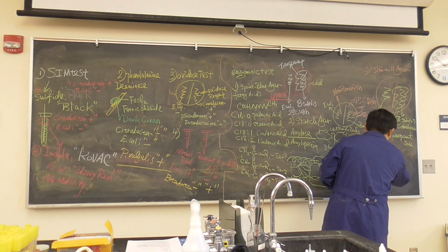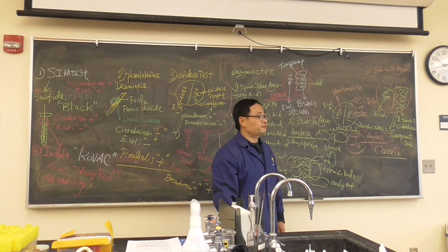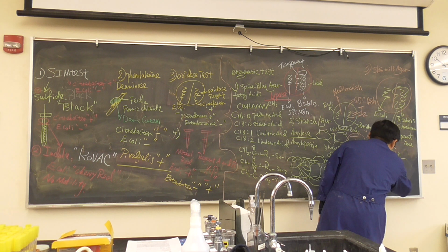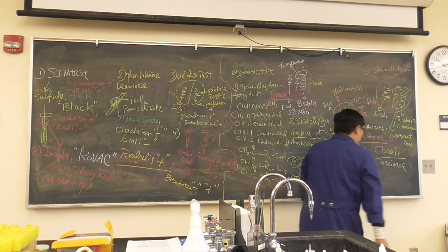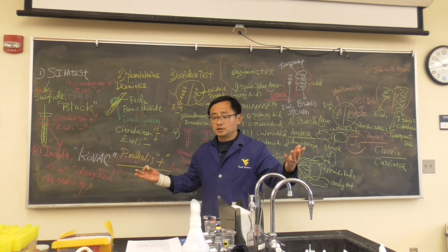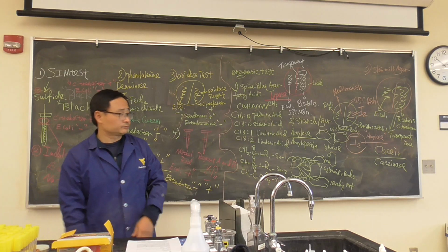That's called casein. Is that right? If bacteria have an enzyme called caseinase, it will break down the protein, which becomes peptides, and later on becomes amino acids.